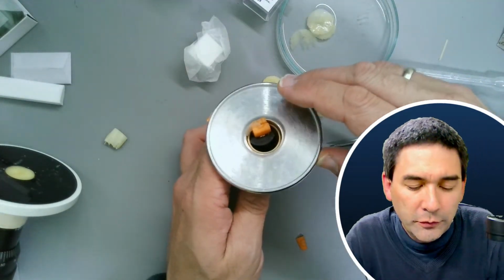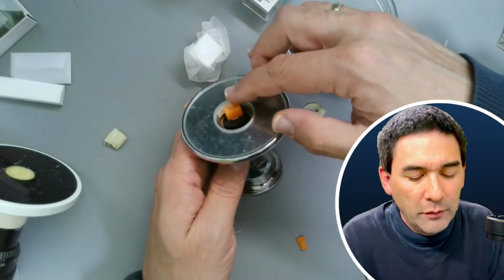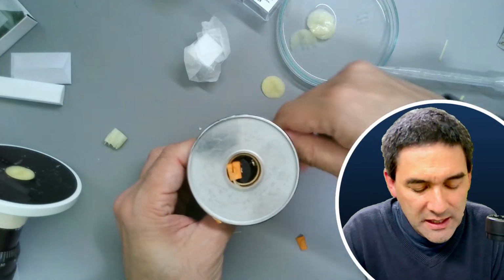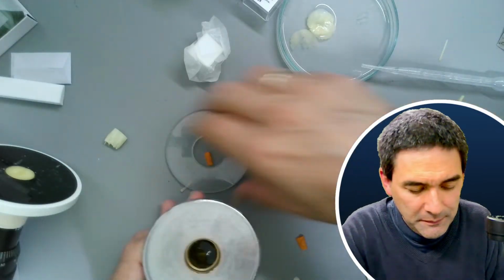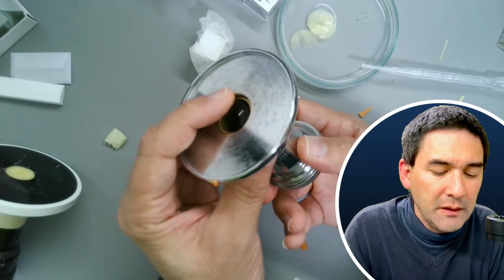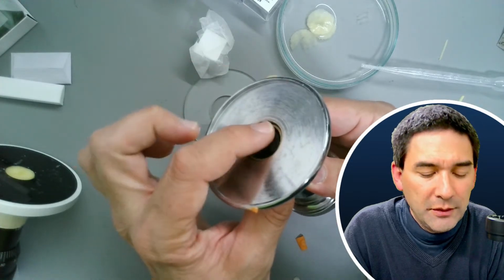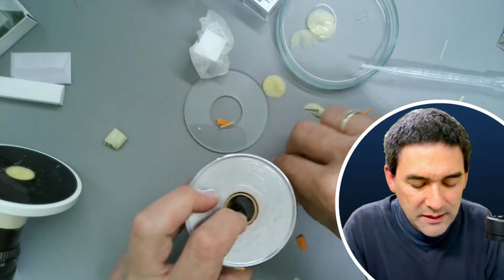What do we learn from this? I just want to show you that the friction of the knife always rips out the specimen. So what you have to do in this case is the following. Take it out completely again. I have to raise everything here. So I'm going to raise everything, and you see that also the clamp comes out further. Let's give it another try.